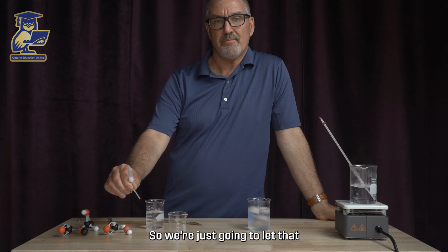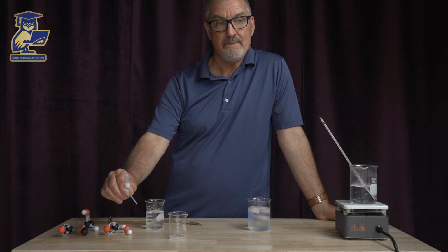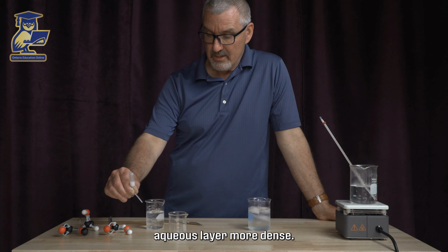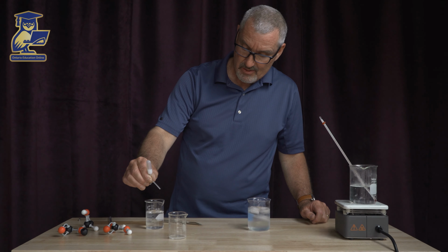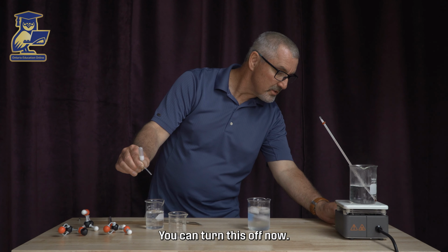So we're just going to let that separate again. It's like shaking up a salad dressing bottle. The ester is going to be less dense, move to the top. The aqueous layer, more dense, is going to eventually make its way to the bottom. Trying to remove as much of the unreacted stuff as possible. Can turn this off now.